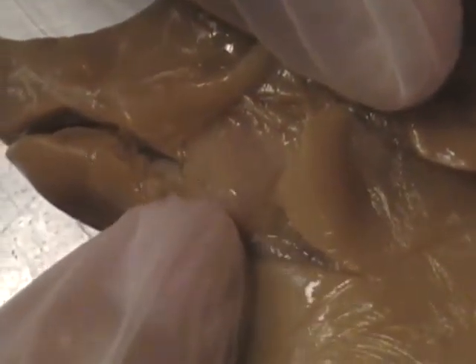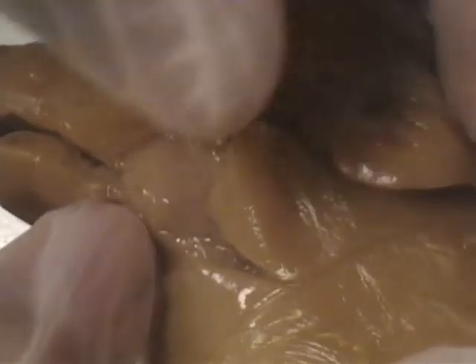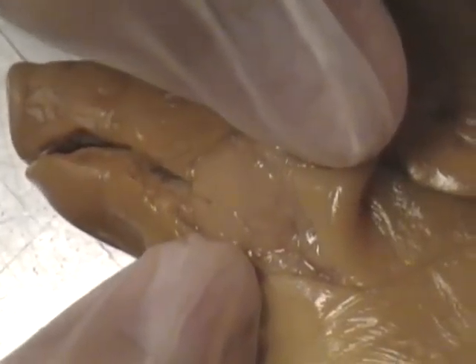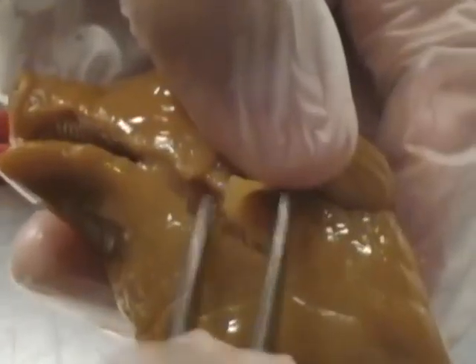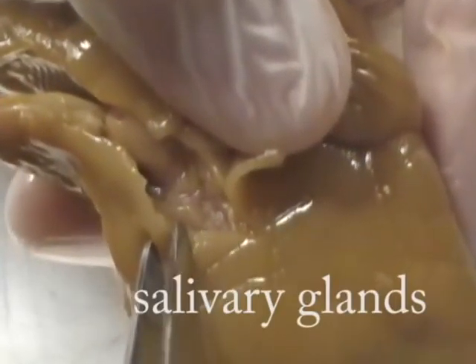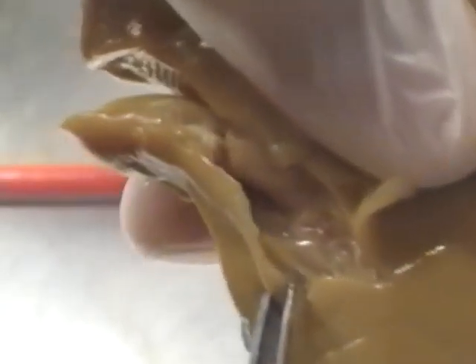So here's the muscle right there. That's the muscle. Oh, can't find the salivary glands. Okay, so you can't really see it, but right there is the salivary glands, which I accidentally cut into. Now it's kind of leaking everywhere, but yeah, we found them.